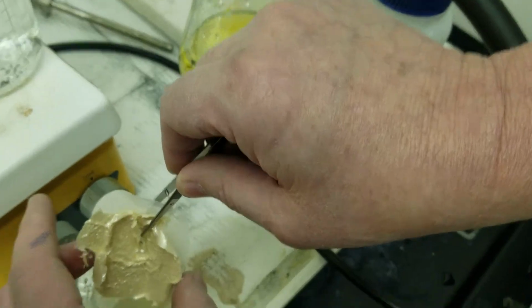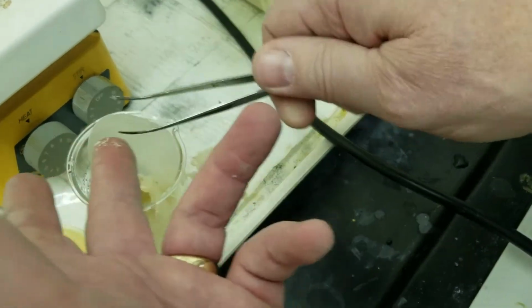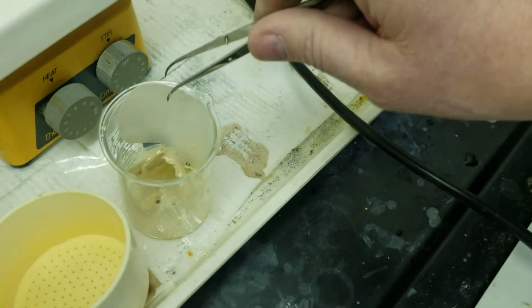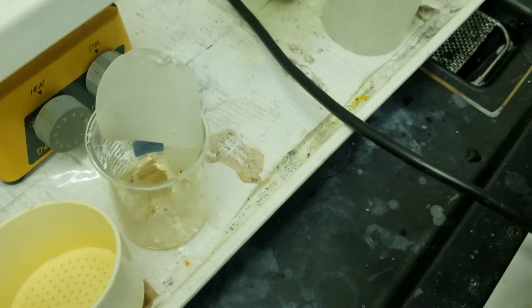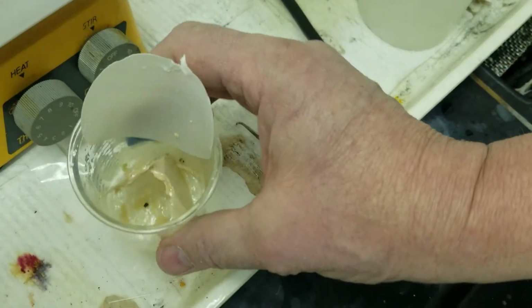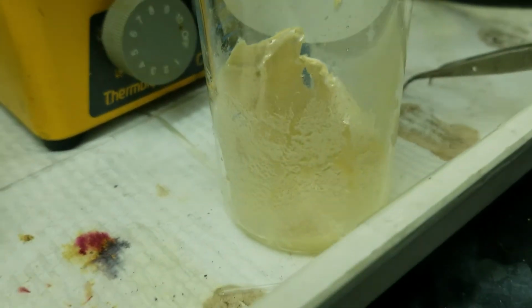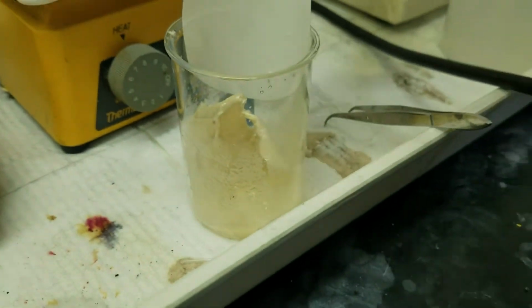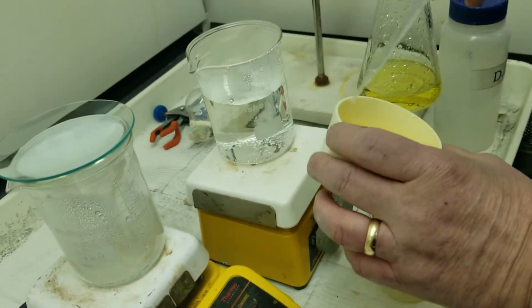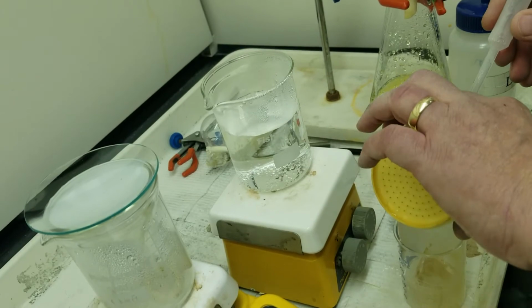Now this acetanilide lab is exactly the same material that we do in 241. We make the students actually repurify our products from 242. So looking down in, you see that? Most of it fell off in a clump. We're going to use this boiling water. I've been boiling the whole lab. And rinse out what's in here first.